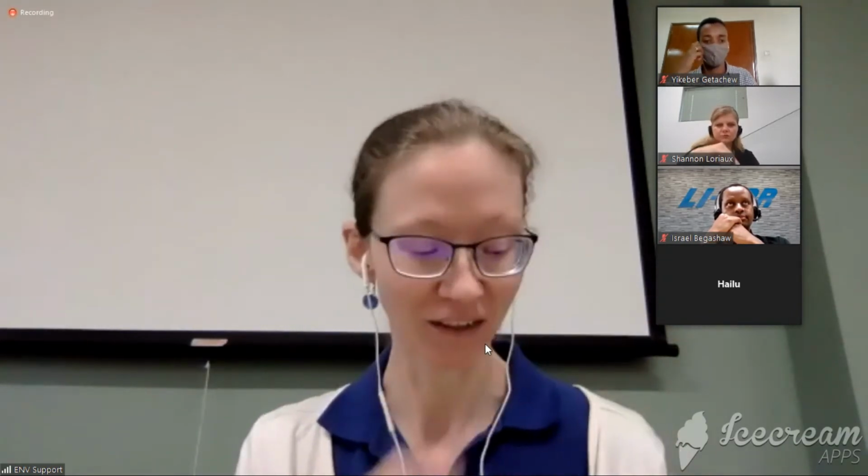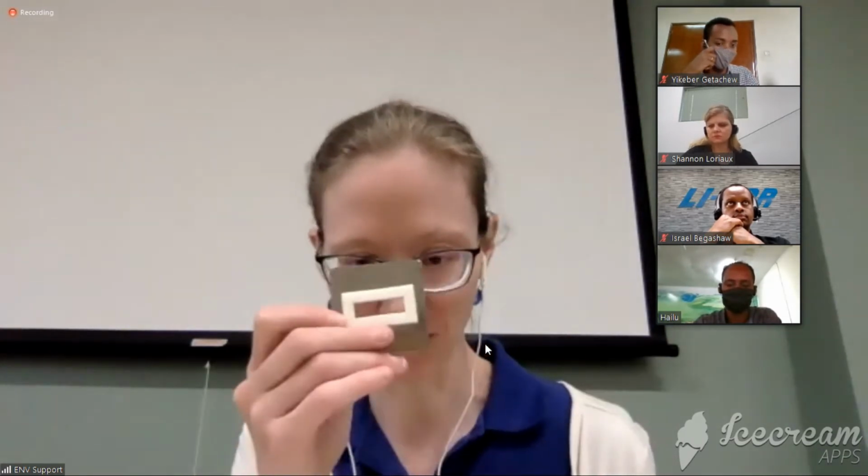I have to say, I wish we'd had these small aperture options when I was working with the LI6400. And I bet Shannon does too, because she was working with wheat and I was working with onions. So both of us have worked with very narrow grasses before. We know the difficulties that you are facing when trying to do that. It's definitely a challenge, and it's nice that the LI6800 has this small aperture.